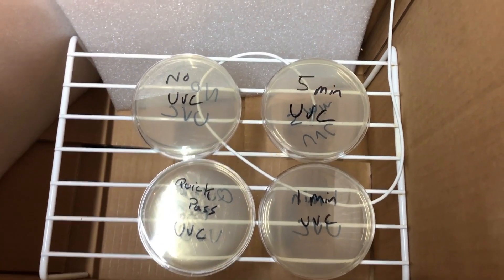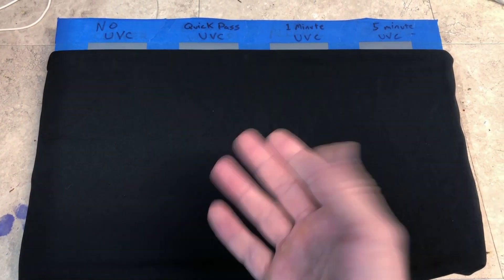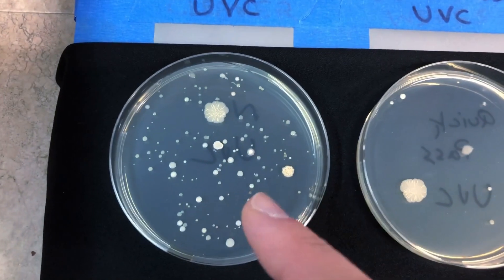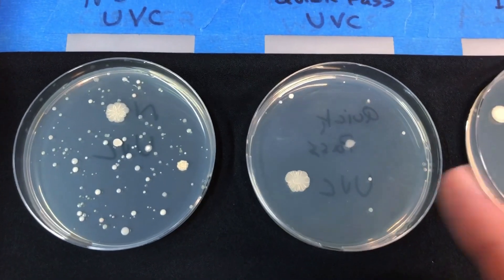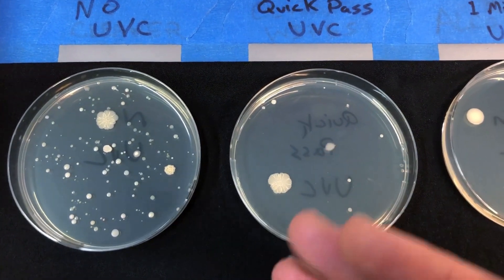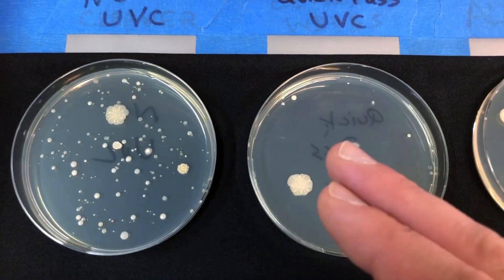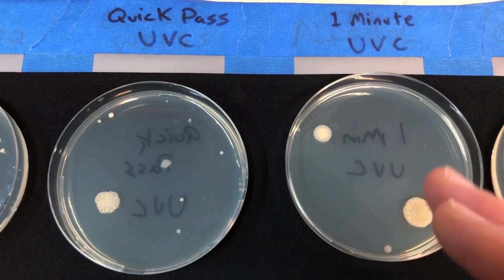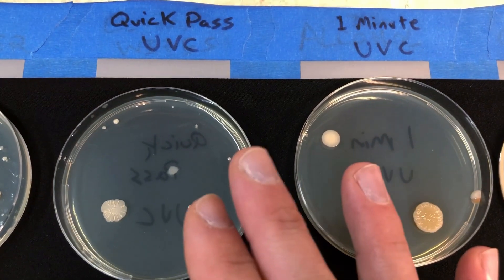These petri dishes have spent four days in the incubator. This is the dish where we did not expose to UVC light — you can see plenty of colonies growing. This is the quick-pass dish, basically waving the wand over the surface in about one to two seconds at about one to two inches away — there's already a significant reduction even with that short exposure. This is the one-minute exposure at eight inches from the surface, and these two dishes are basically the same result, which is very interesting.